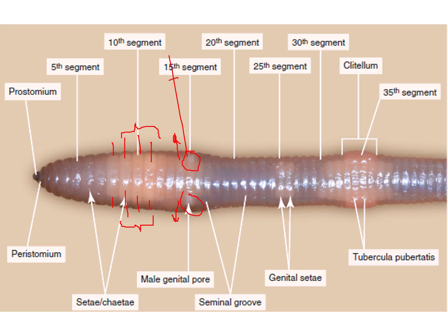The sperms of another individual that this individual got during copulation would come out from the spermatheca pore, and then run toward the oviduct or female genital pore where the eggs would be present. So it would fertilize them, and the eggs would come out and reach the lateral side of the body.